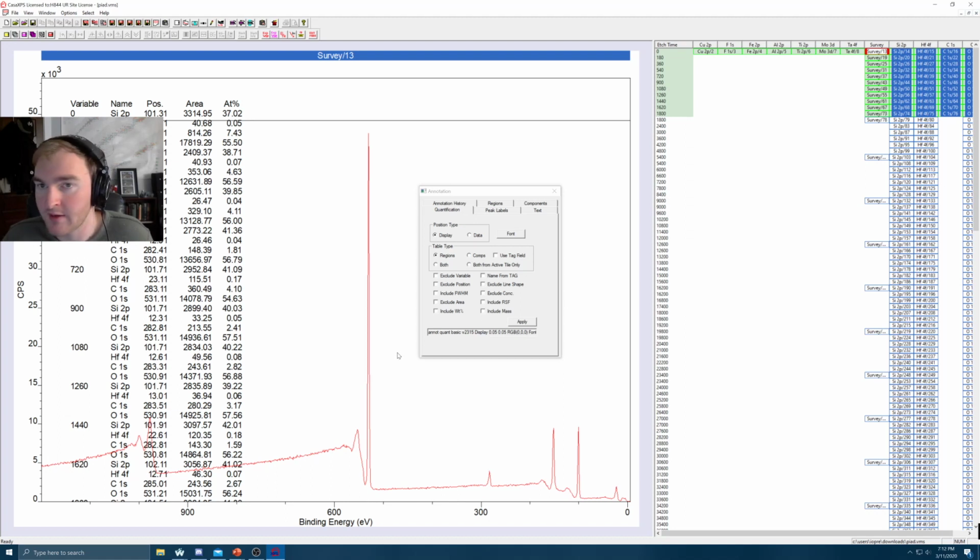We have a lot of data in this, so what we would like to do is export it to Excel, and then maybe further to Origin, or whatever plotting software you use, and then generate whatever reports we want with the atomic percent values. So maybe we want to do a silica to oxygen ratio, or we want to show a silicon to hafnia ratio, or I mean, at that point, you can do anything you want.